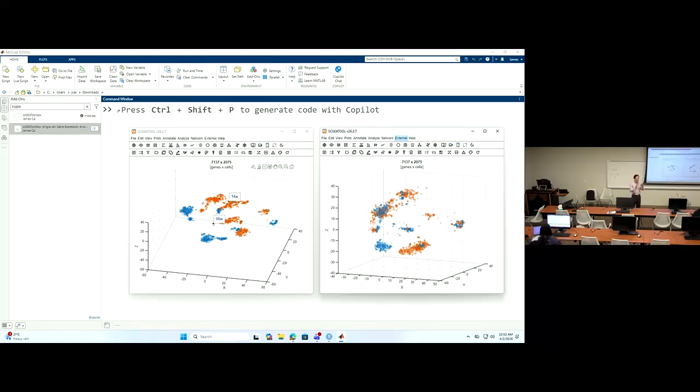Okay, I have done my job, and I showed you how to do this harmony batch correction. This is the before. Okay, before merging. This is after. Run 2 rounds of the Monaco, not Monaco, harmony. That's what I achieved. So I will just go around and make sure you are okay with this, and we can have a break.